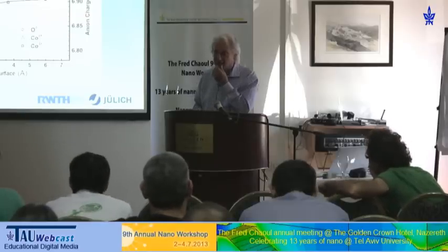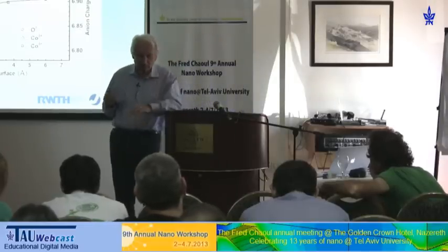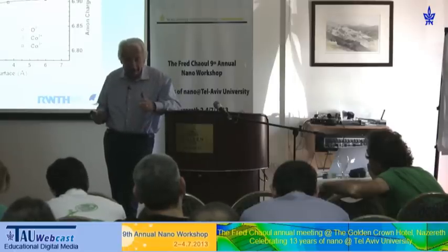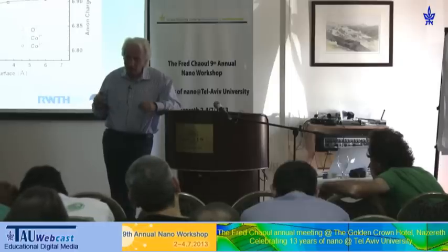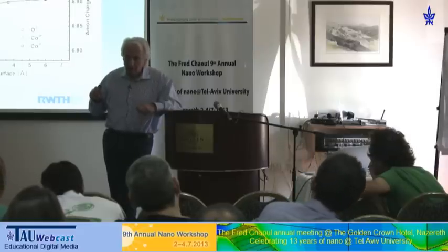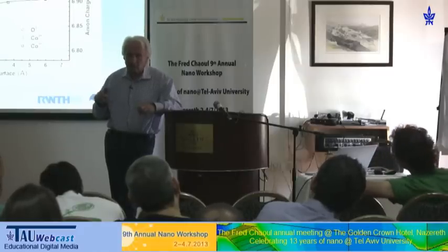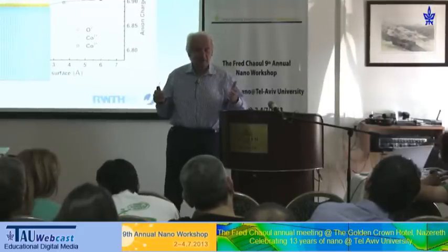Yeah, that's right. So I think that the general problem remains with electron microscopy, that you have radiolysis in organic materials, and you get radiation damage. And the radiation damage comes in because you need a certain minimum dose, that means electrons per square angstrom, to get picometer precision, because it's a signal-to-noise ratio which counts.